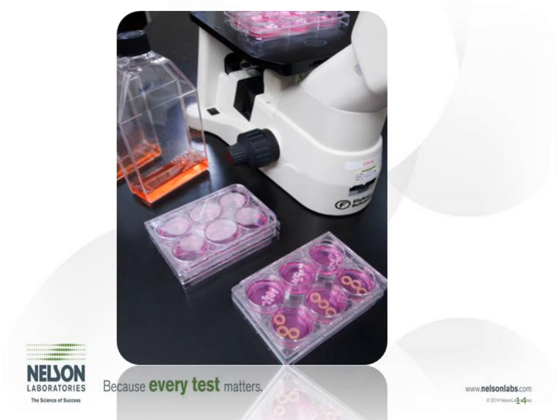And we give them everything they need to grow and be happy. And then once that flask becomes confluent, or is completely covered in cells, we then break those cells apart and we seed those cells onto the plates. We use 6-well plates for the cytotoxicity test generally. We can go smaller. But we put the cells on the bottom of those wells, and now the cells will start to grow on the bottom of those wells. And so they become confluent on the bottom of the well, and now we have our test system.